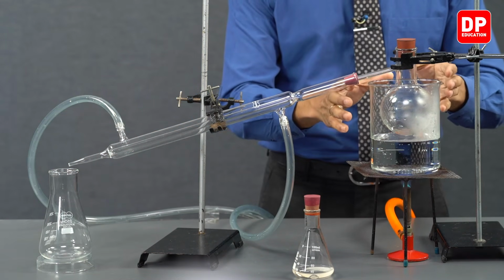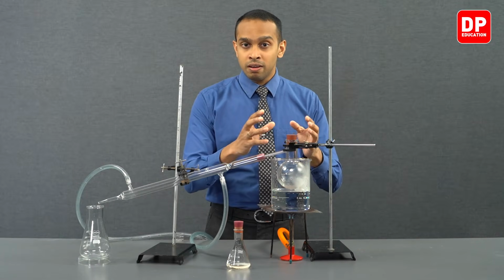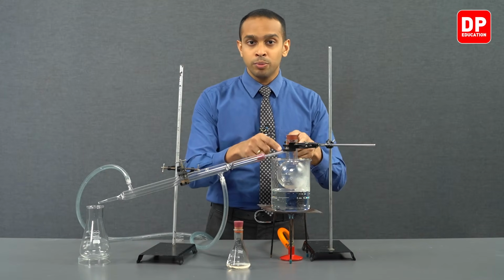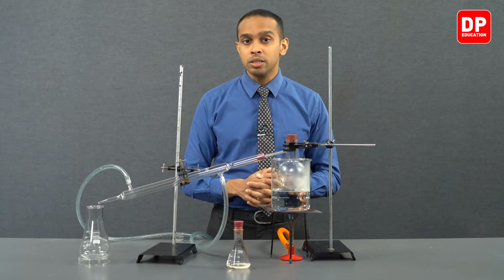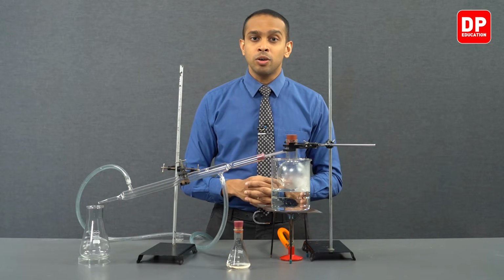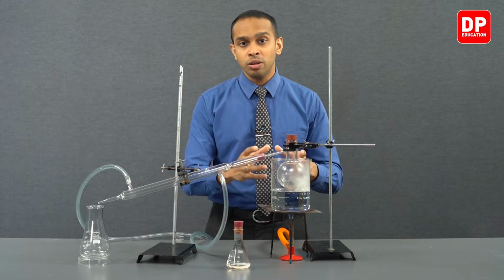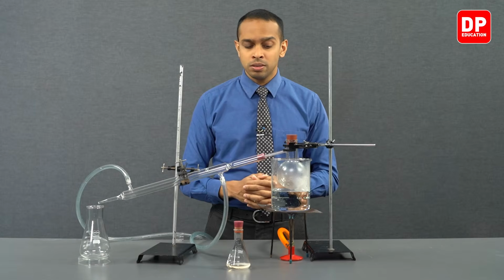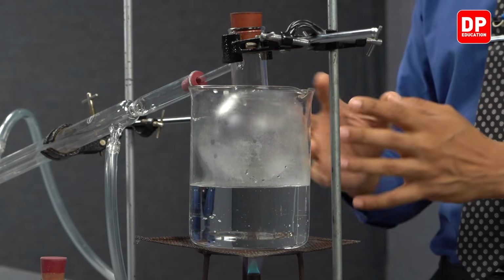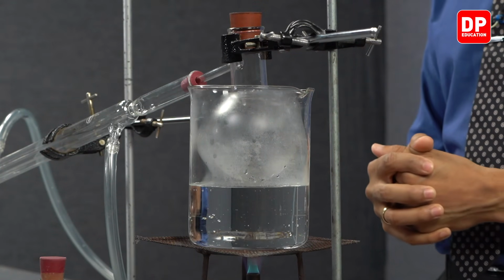And in this distilling flask we have over here, you will see the component which has a higher boiling point remaining here. The component that had the higher boiling point was the essential oil, which had a boiling point of around 254 degrees Celsius. Eugenol had a higher boiling point. Since we are using a steam bath to heat this, the temperature of the system will never increase enough to boil out eugenol.